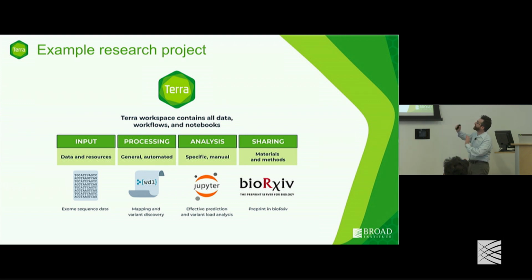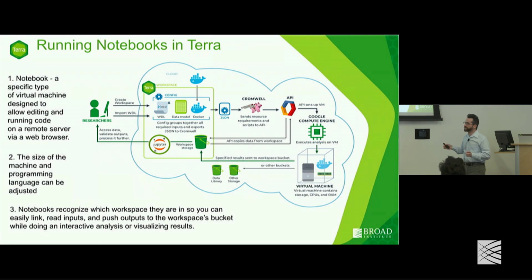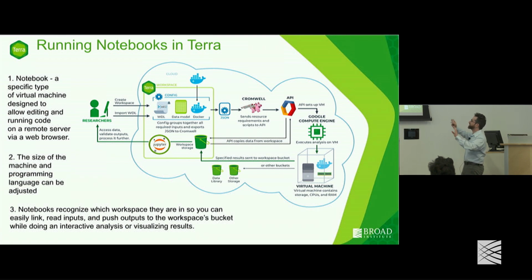So this is kind of an example workspace. Here's a slightly more high-level view so that we can understand where exactly the Jupyter Notebook lives with respect to both the workspace and the cloud. So up there is us. We're the users, and we have direct access to this portal. So we have this box to indicate the workspace.